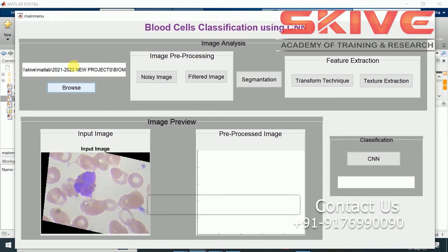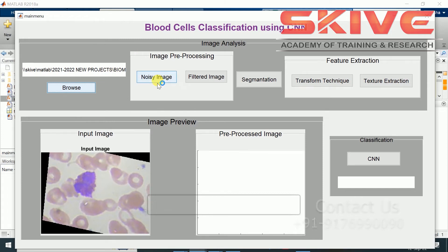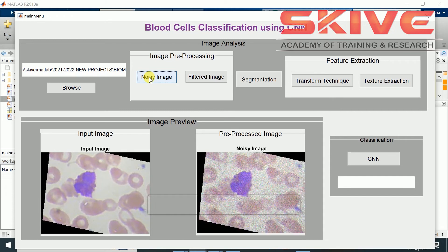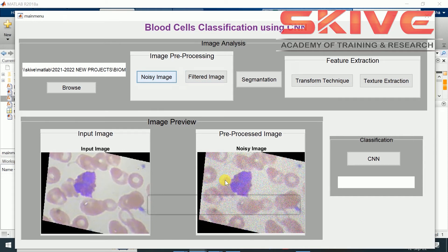After that we have to convert into the preprocessing step. First the noise will be added to the image.